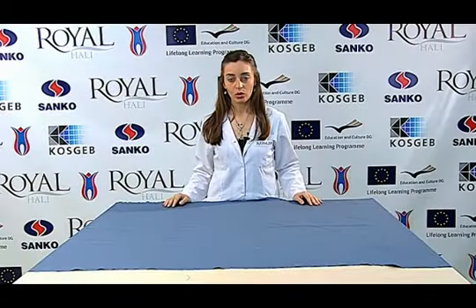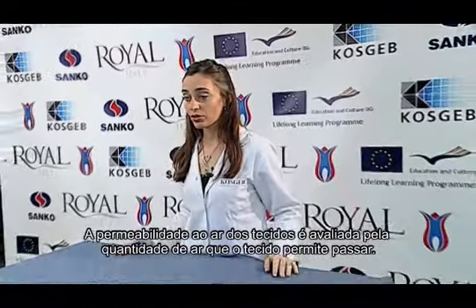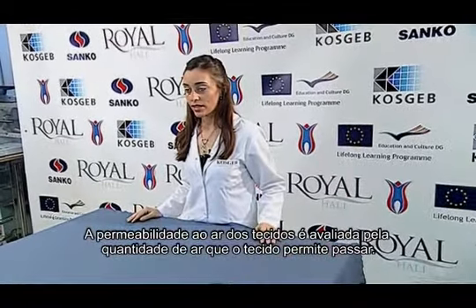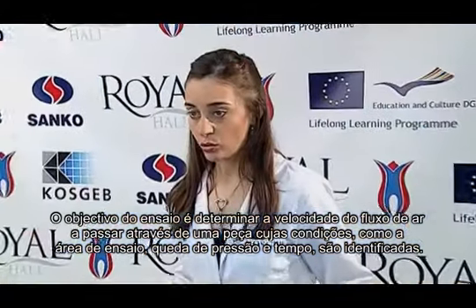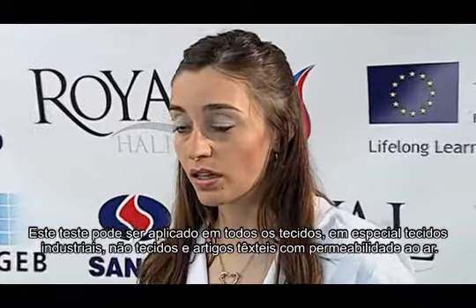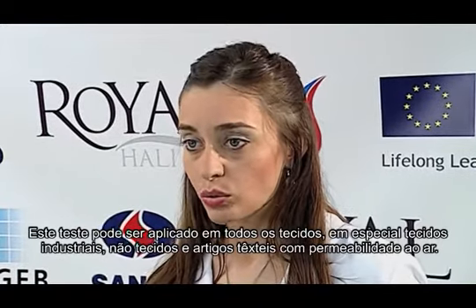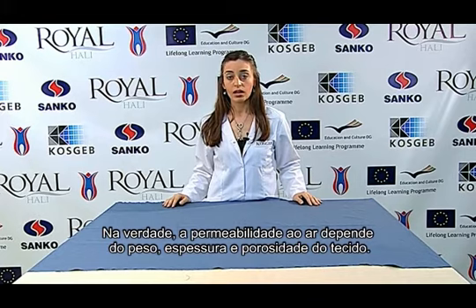Hi friends! Air permeability of fabrics is a measure of how much the fabric allows air to pass. The aim of the test is to determine the flow speed of air passing through the testing piece, of which the conditions such as the testing area, fall of pressure and time are identified. This test can be applied to all fabrics, in particular industrial fabrics, non-woven fabrics and textile products with air permeability. Actually, air permeability depends on fabric weight, thickness and porosity.